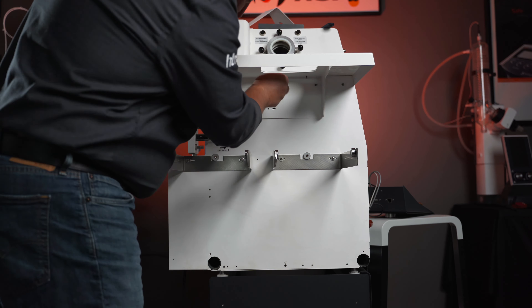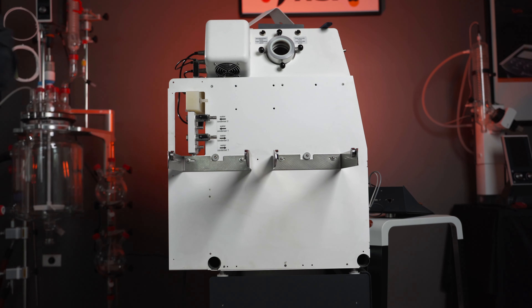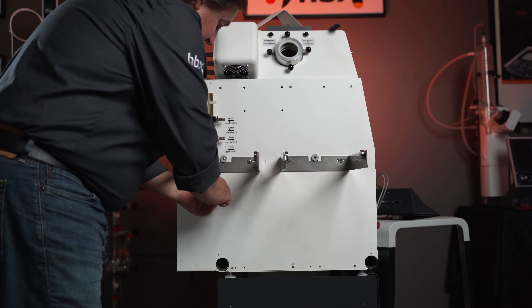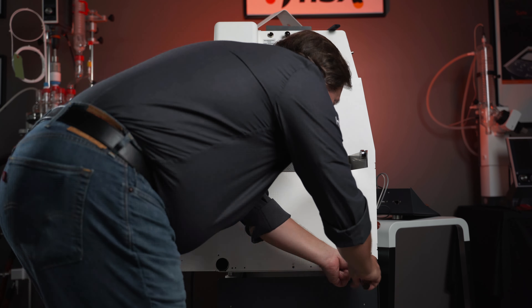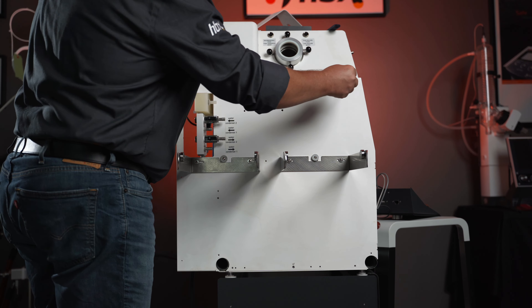Once the screws are removed, we'll basically lift up on the mantle and it'll slide right off. Once you have your mantle removed, grab a T10 drive — there are going to be six screws here that we have to remove. Then, to finally remove this panel, grab a T10 Torx drive and on the top here we have three final screws to remove.